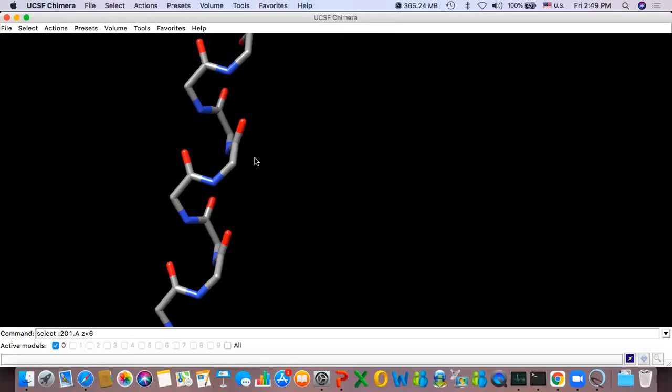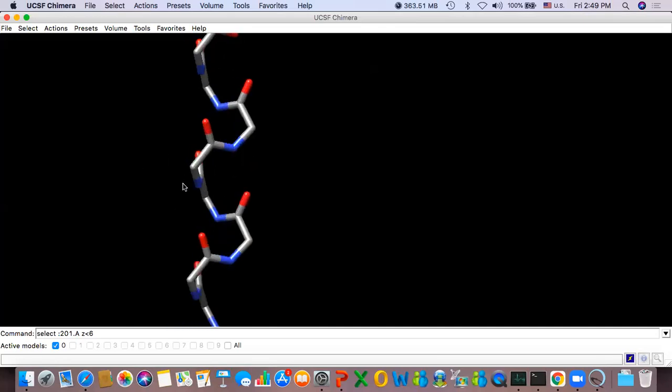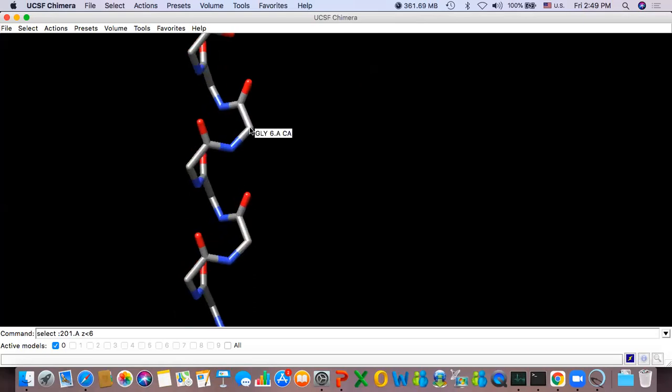So you don't have to worry about it. Let's say this is my N, this is C alpha. This is the carbonyl, not C alpha. N, C, right? So let's look at this particular bond. This is N, C alpha. This is the phi angle that I want to change.